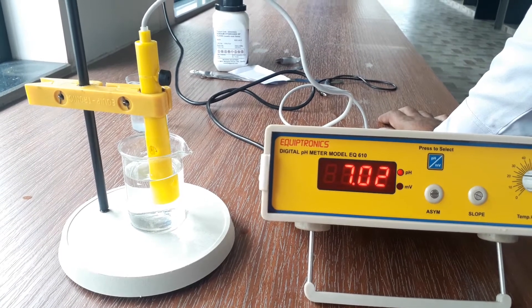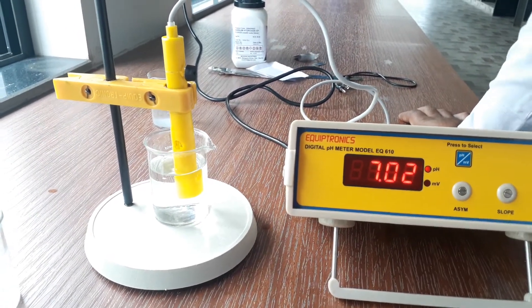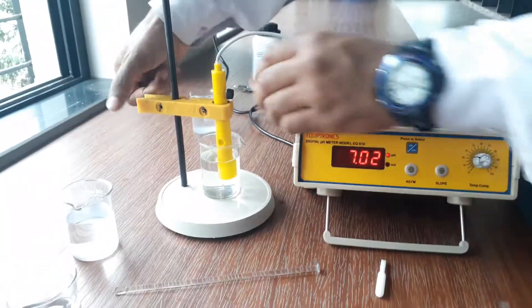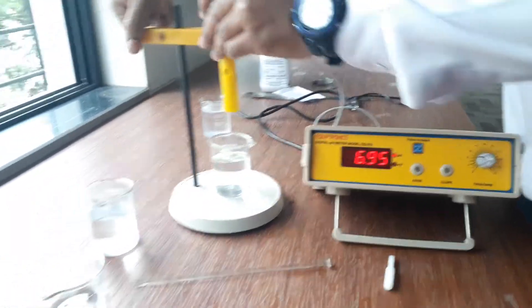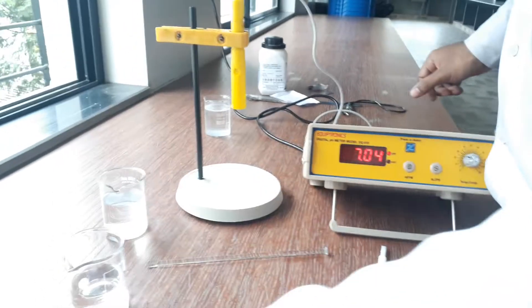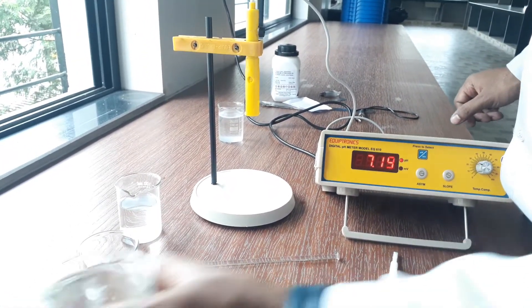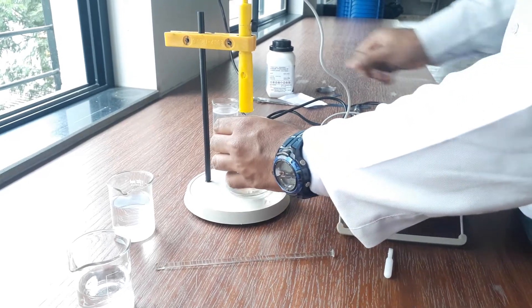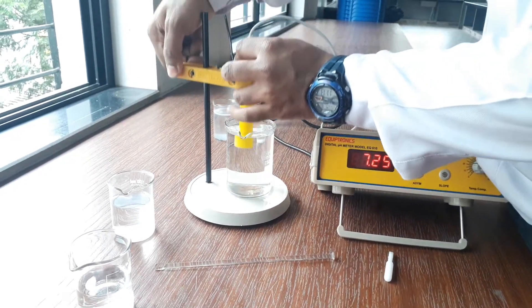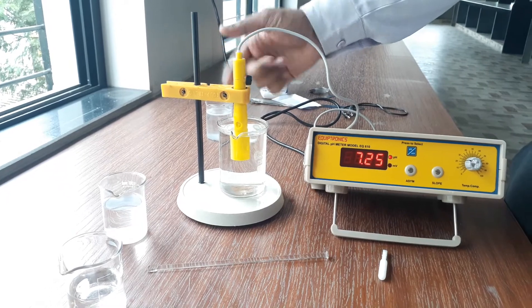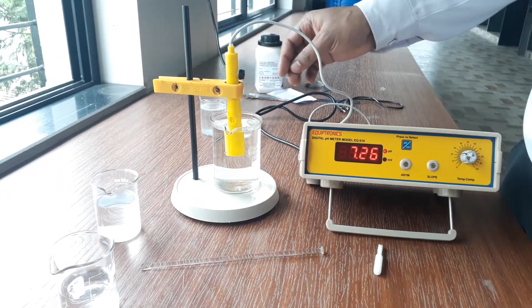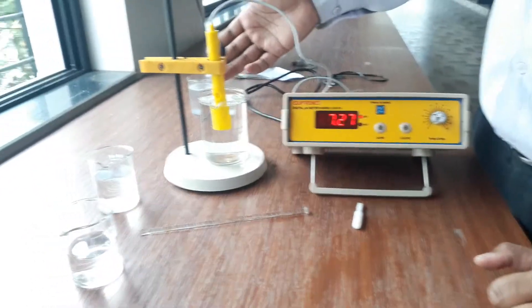Now we will take another solution, that is HCl. So here first we will dip this solution. Whenever we are taking another test, we have to wash this glass rod or you can say sensor, so that whatever liquid is there on the surface of that sensor will be cleared.